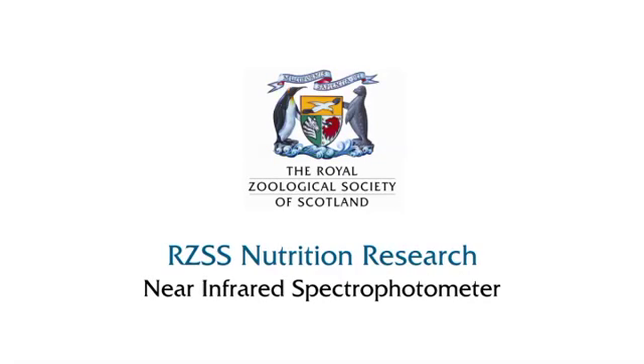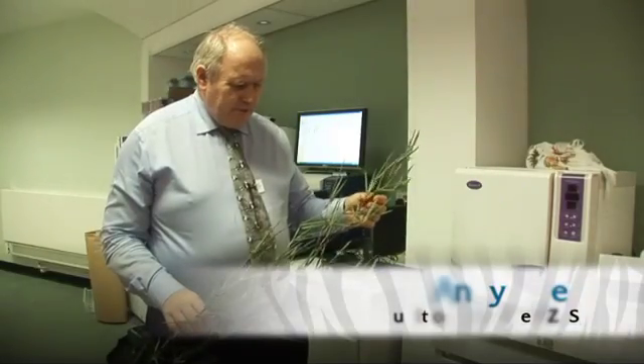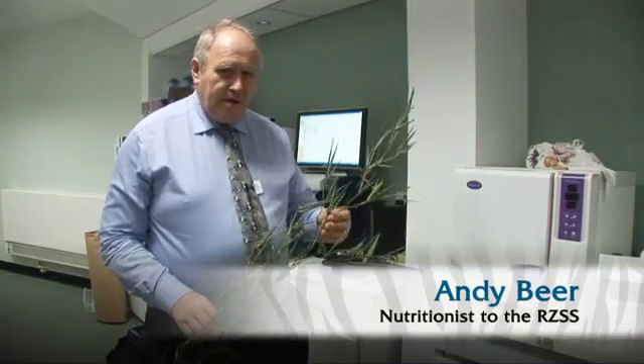I'd like to explain in this short bit of film how we at RZSS are using the near-infrared spectrophotometer to actually analyse forage samples for our zoo animals here, and also for other collections in the United Kingdom.